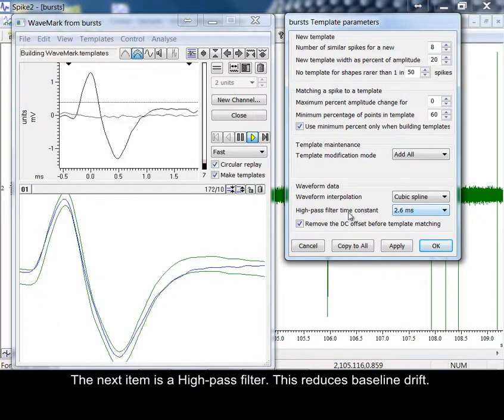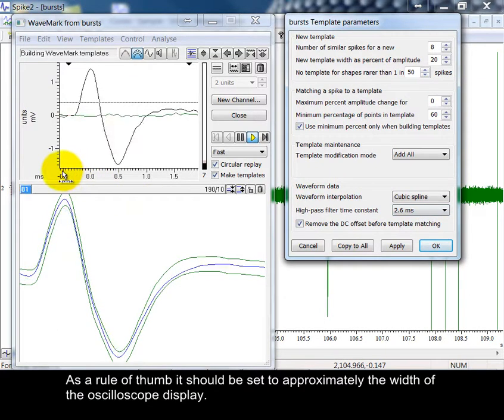The next item is a high pass filter. This reduces baseline drift. As a rule of thumb, it should be set to approximately the width of the oscilloscope display.